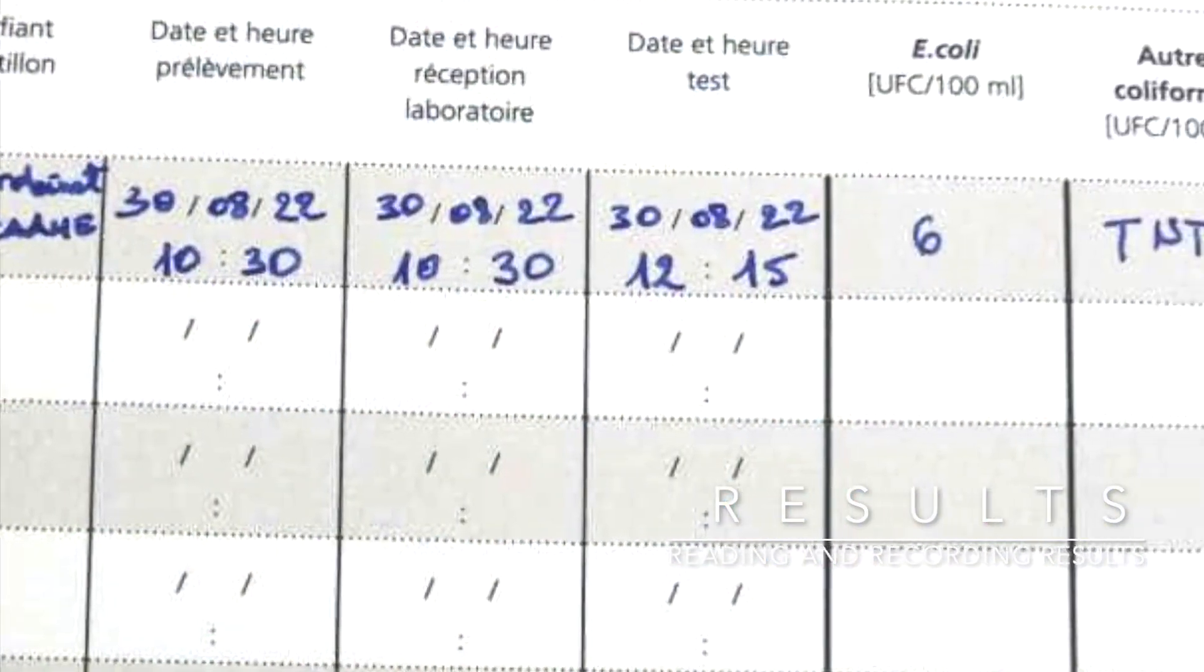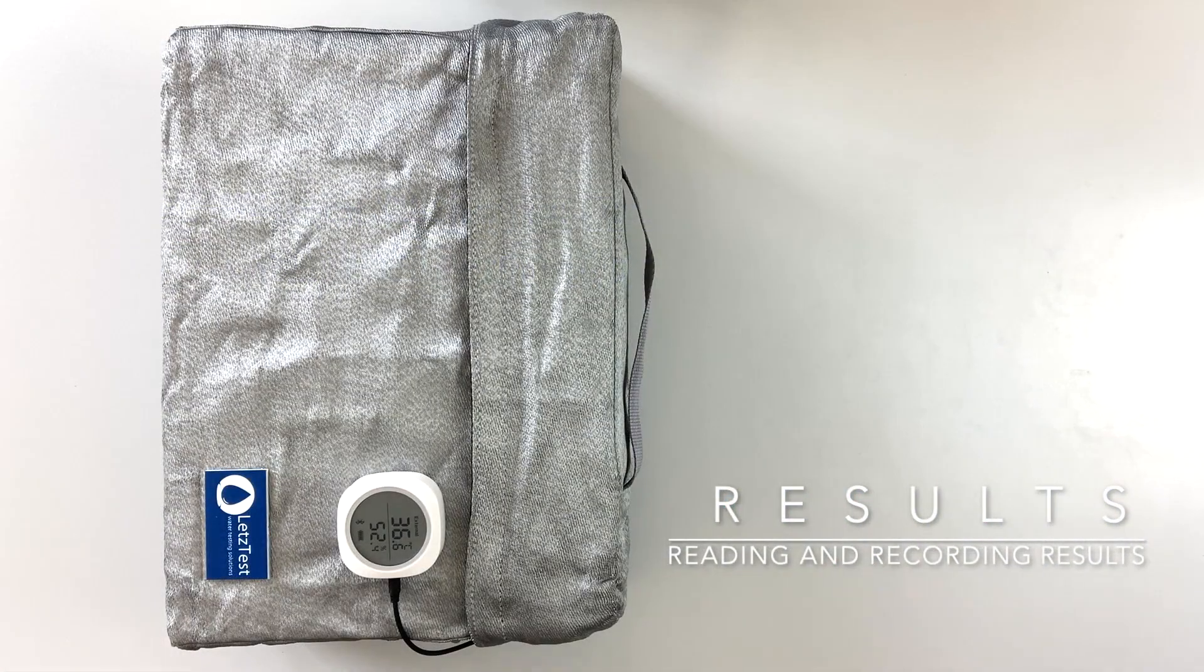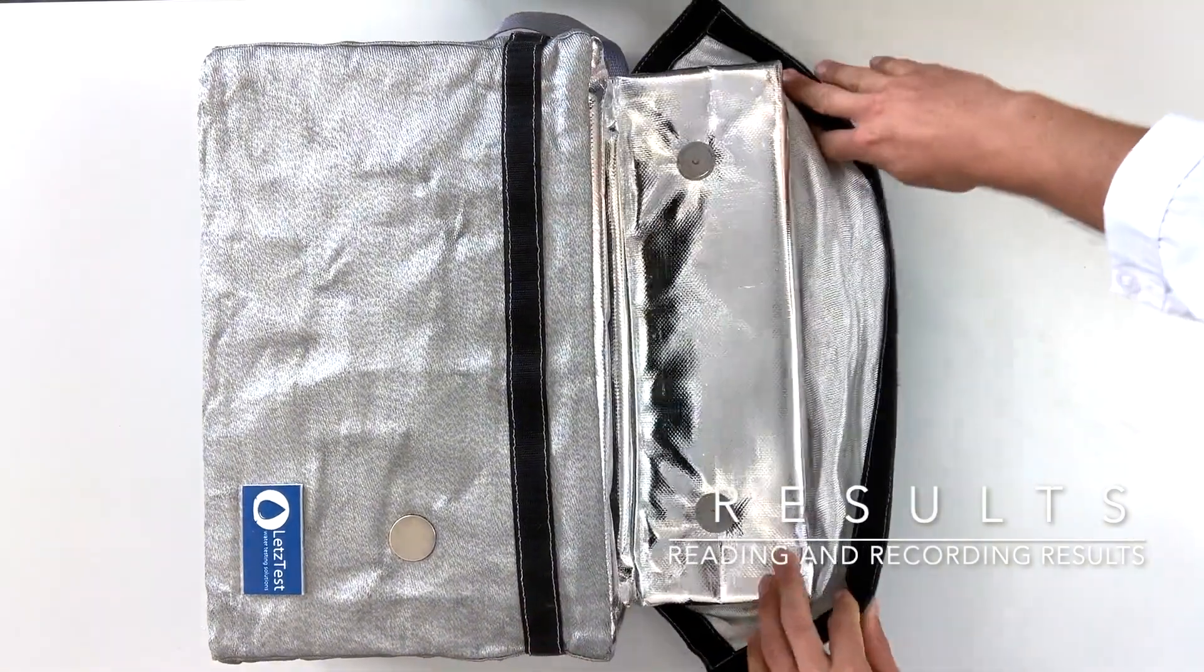After 24 hours, the incubator is still at 37 degrees. Open it and take out the plates.